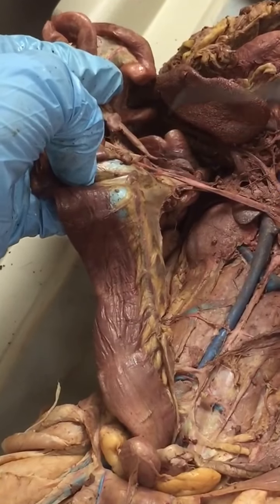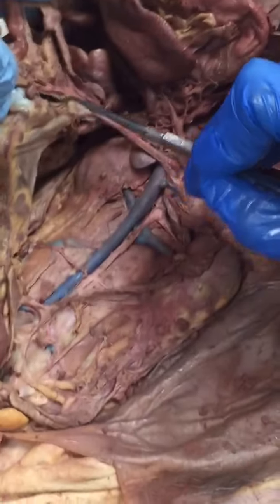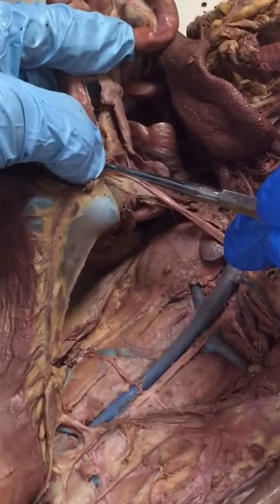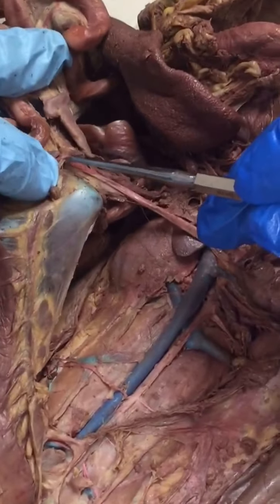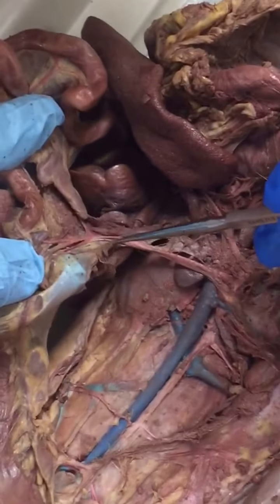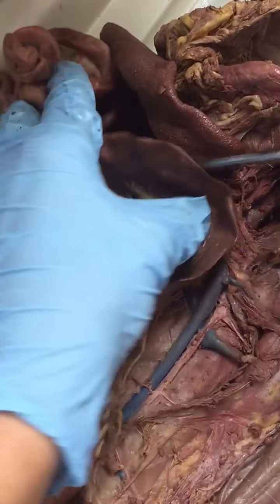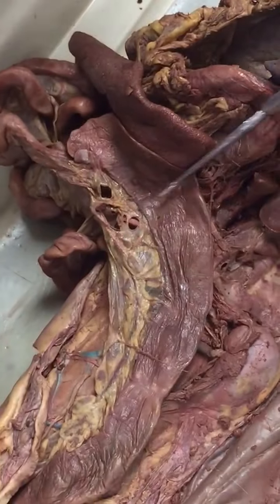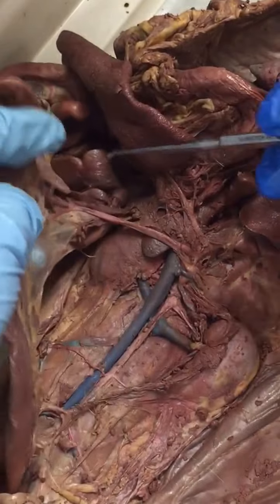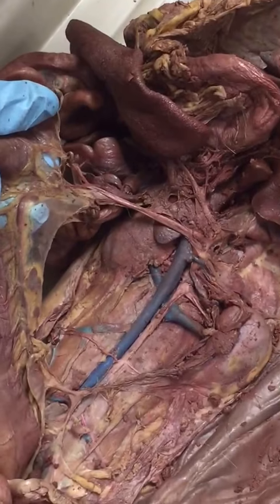The left colic artery in this specific cat is different than most. It goes directly into the cranial mesenteric, but imagine that it's actually feeding into this middle colic here, because that's how it is on most cats. Okay, so if I'm following my cranial mesenteric artery here, the first branch is typically the middle colic right here, which if you flip that over, goes to the transverse colon. So middle colic makes sense, it goes to the transverse colon. And then the left colic typically branches off of the middle colic and goes down the descending colon.